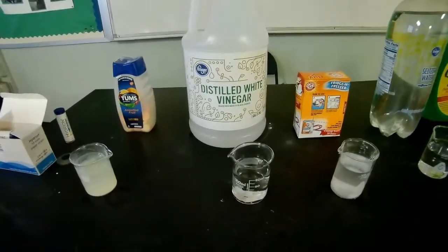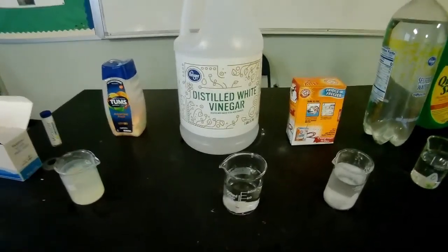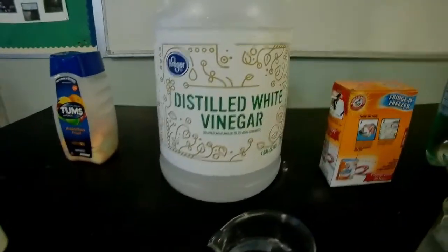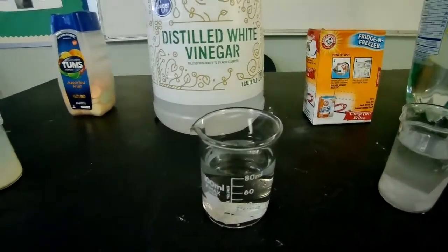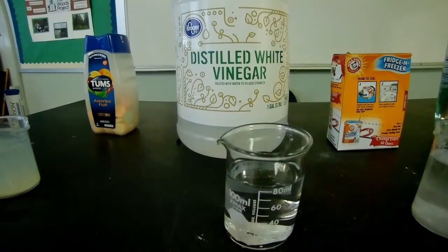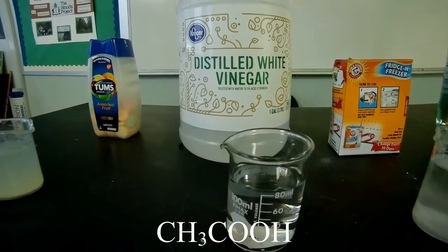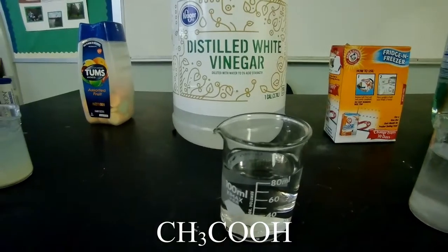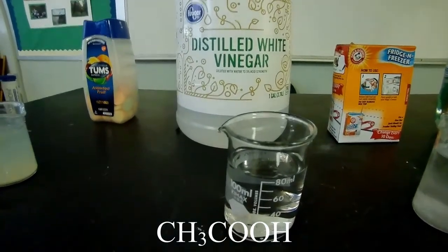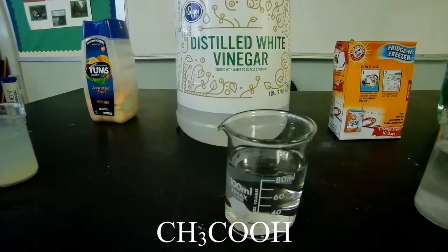All right, moving on to chemical number 2. This is going to be vinegar. And this is what it looks like. All right, the chemical formula for vinegar is CH3COOH. It's a pretty big molecule. It's got a lot of different elements to it. And that one could maybe go either way.